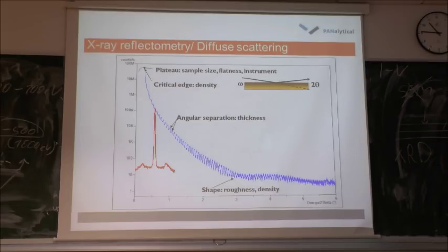Plus, if you have a heterostructure, let's say one film is very thick, and one is very thin. With the thin one, you get, basically, it goes pretty deep. But you have a superposition of smooth fringes on fringes which are broad. So basically, it can be very nicely applied to heterostructures with quite different thicknesses. If thicknesses are very comparable, then the modeling gets complicated.